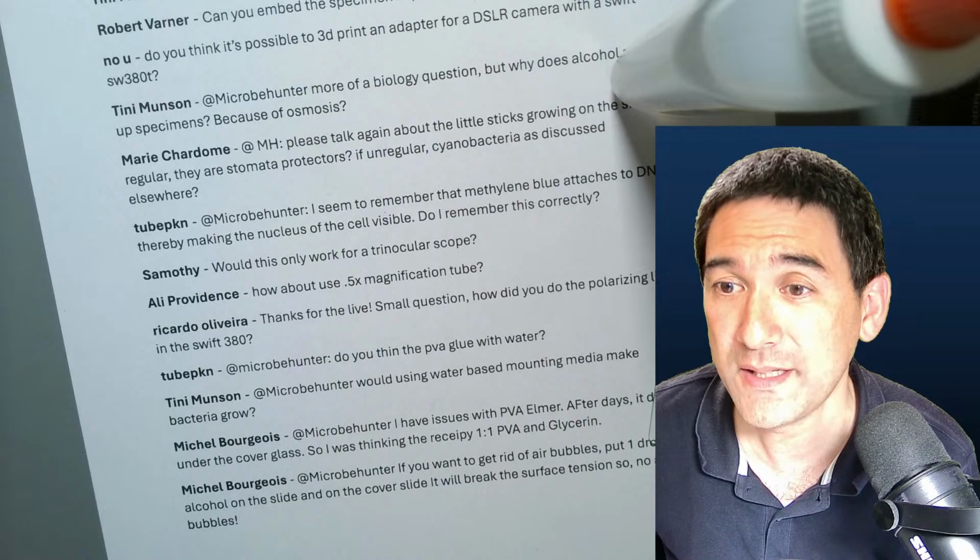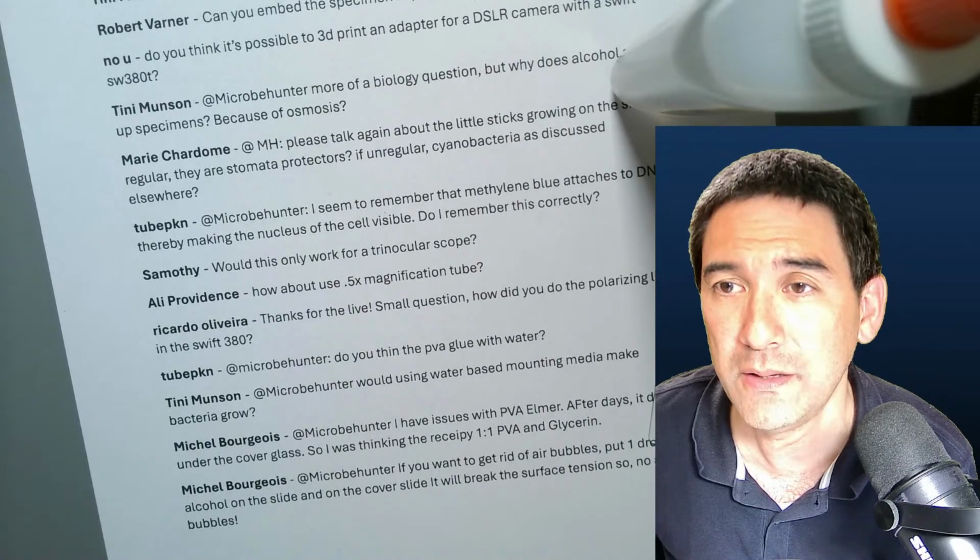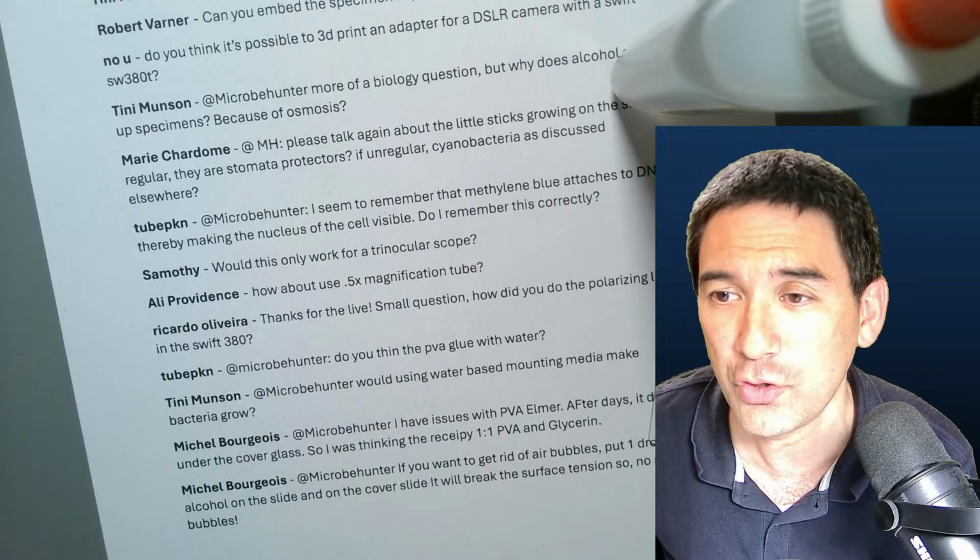It dries and disappears, evaporates. I guess you mean the wet chamber.